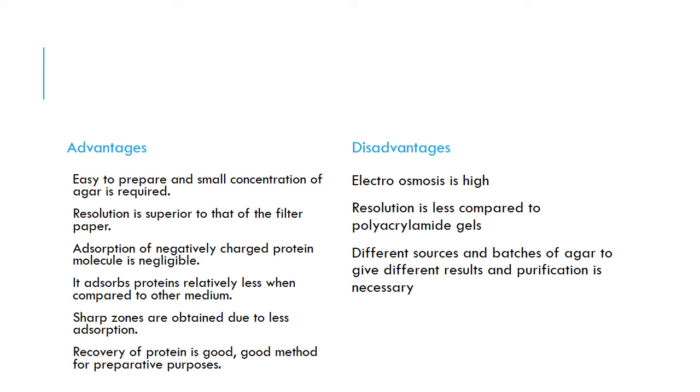If you have that, you'll be able to prepare it, and then you're good to go. Again, the resolution is superior to that of the filter paper. We also have paper electrophoresis, so when you're talking about the resolution, it will be superior when compared to that of the filter paper.